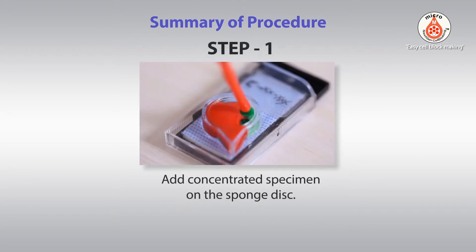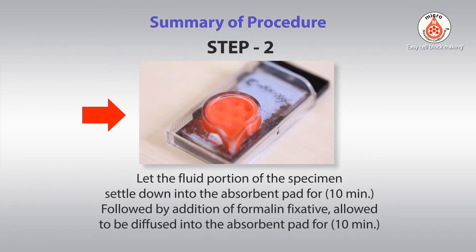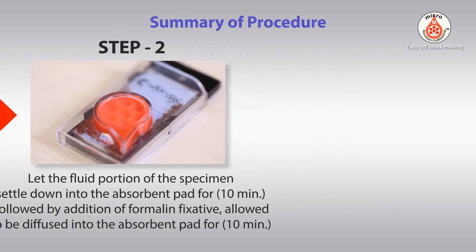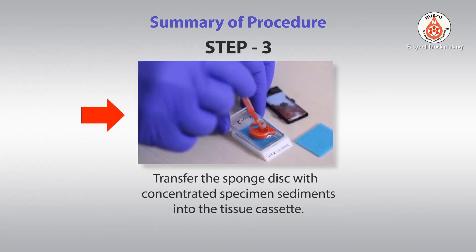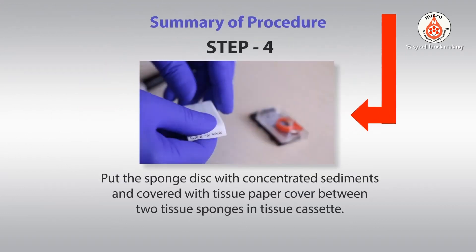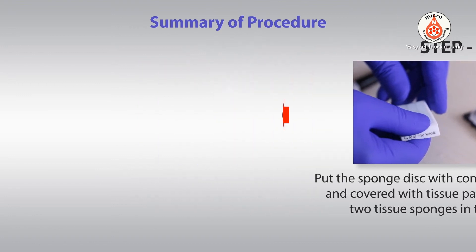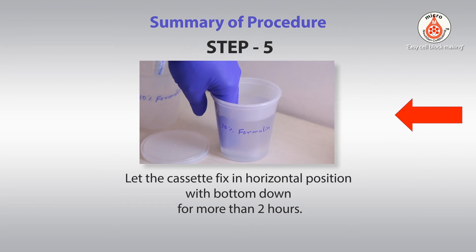Summary procedure: Step 1 — add concentrated specimen on the sponge disk. Step 2 — let the fluid portion of the specimen settle down into the absorbent pad for 10 minutes, followed by addition of formalin fixative allowed to diffuse into the absorbent pad for 10 minutes. Step 3 — transfer the sponge disk with concentrated specimen sediments into the tissue cassette. Step 4 — put the sponge disk with concentrated sediments, covered with tissue paper, between two tissue sponges in the tissue cassette. Step 5 — let the cassette fix in horizontal position with the bottom down for more than 2 hours.